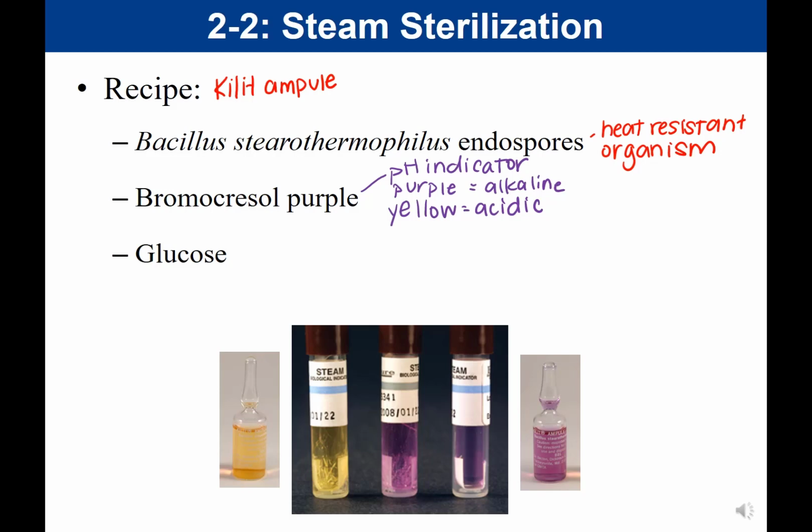And then we have our glucose, and this is there for fermentation.